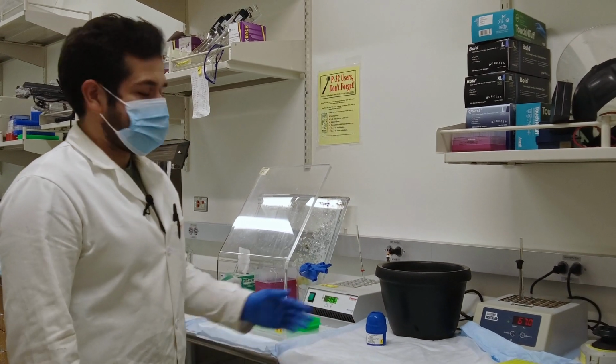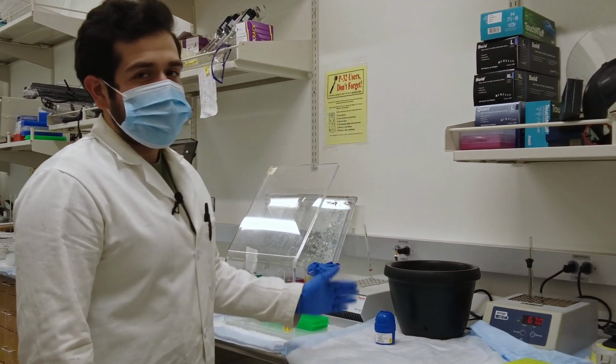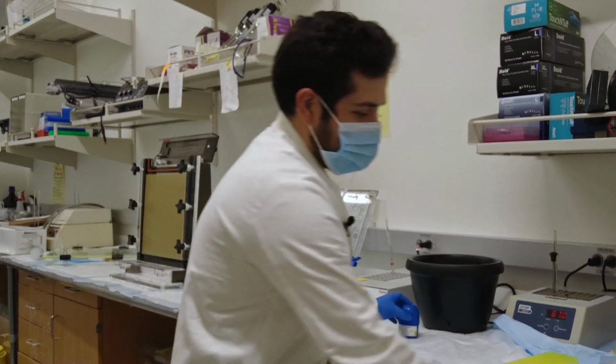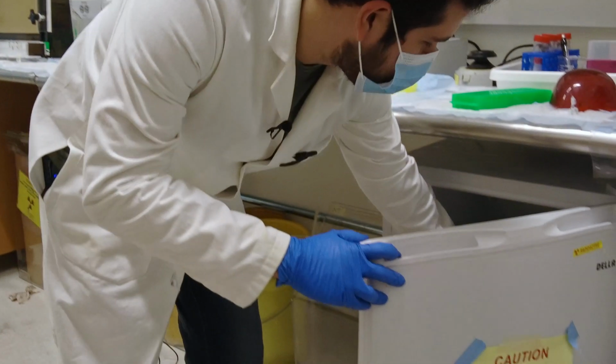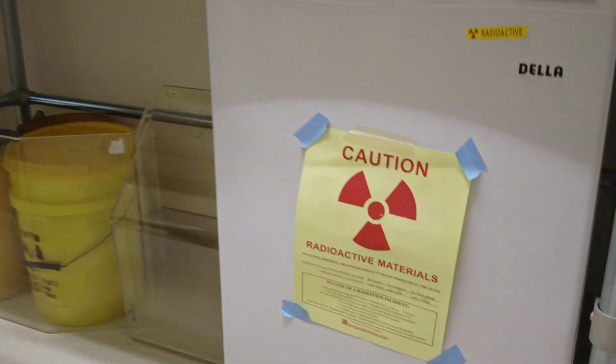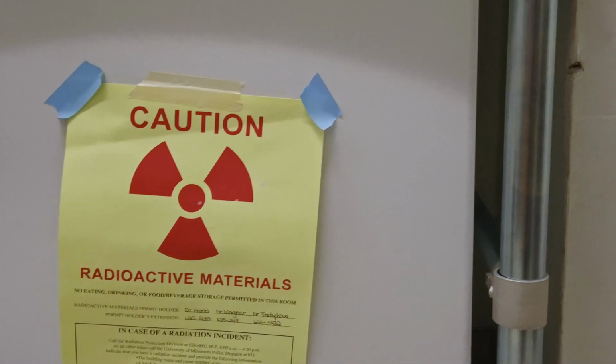After you're done using your radioactive ATP, make sure you put it right back in its blue container and right back in the freezer. When you're working with radioactive material, you only want to keep it out as long as you possibly need to have it out. So please, right after use, put it back.